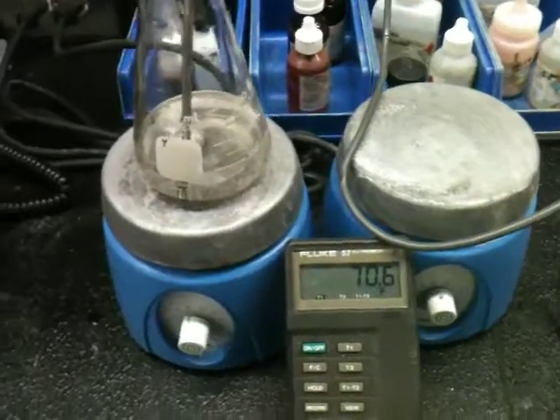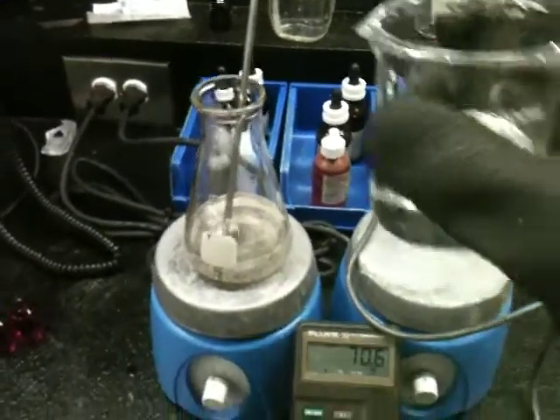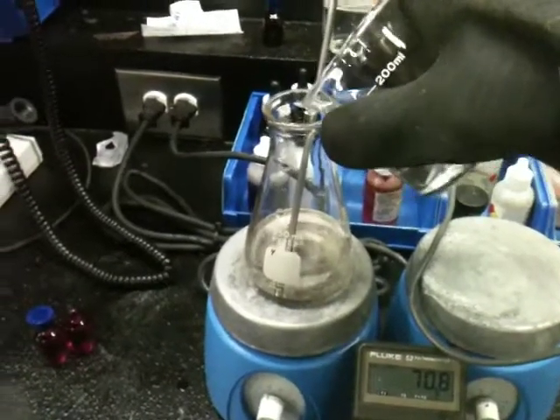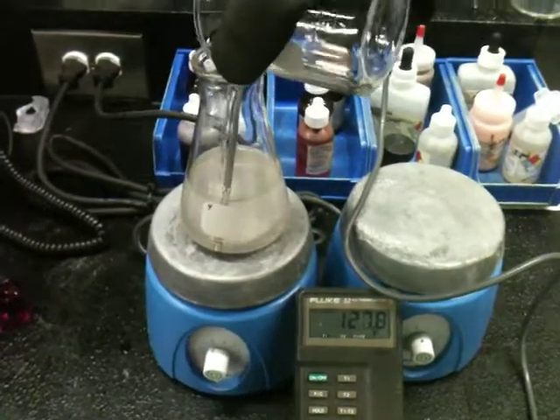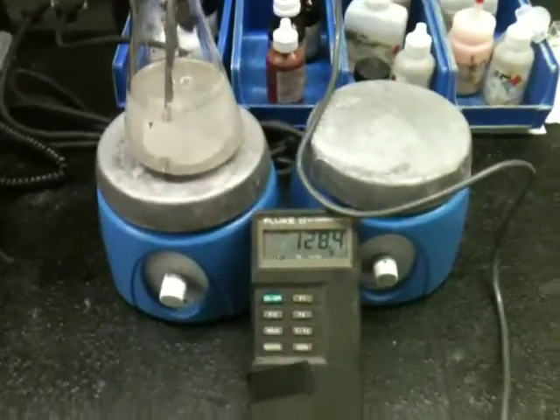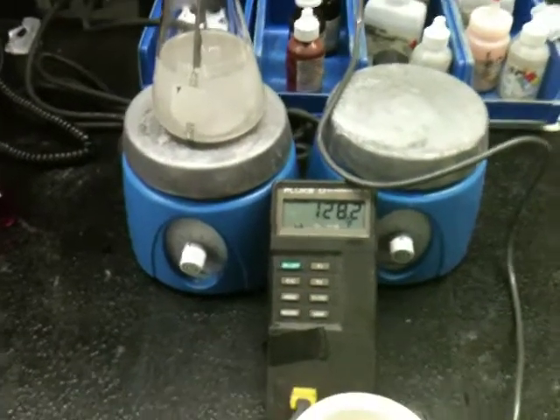Now I'm going to add 100 milliliters of the sodium hydroxide. As you can see, the temperature is quickly climbing, and it turns a cloudy white.